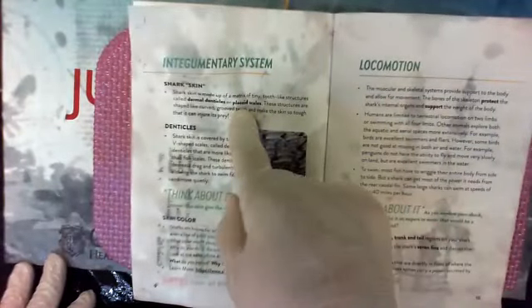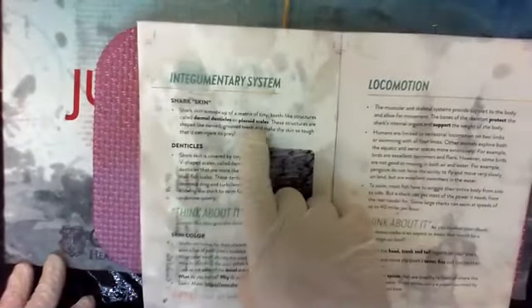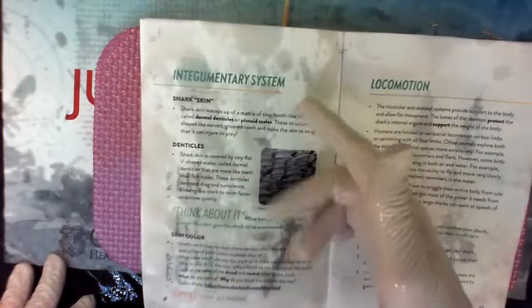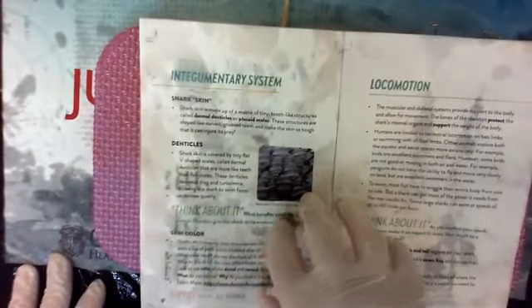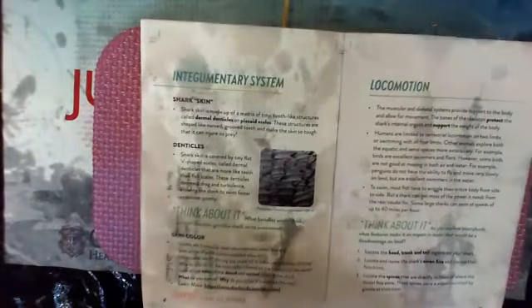Integumentary system thinks skin, right? Skin is one organ in that system. Other organs are hair, nails, glands. Those are all organs, right? Individual organs, because they're made up of different tissues inside. The integumentary system of a shark is actually pretty sweet.